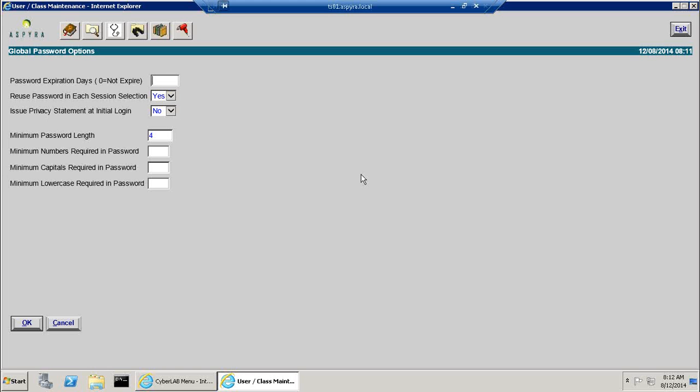And if your user password and username are known to somebody else, it's possible for them to go in and do some activities that would be attributed to you. And if they needed to be questioned, then your name would be there instead.